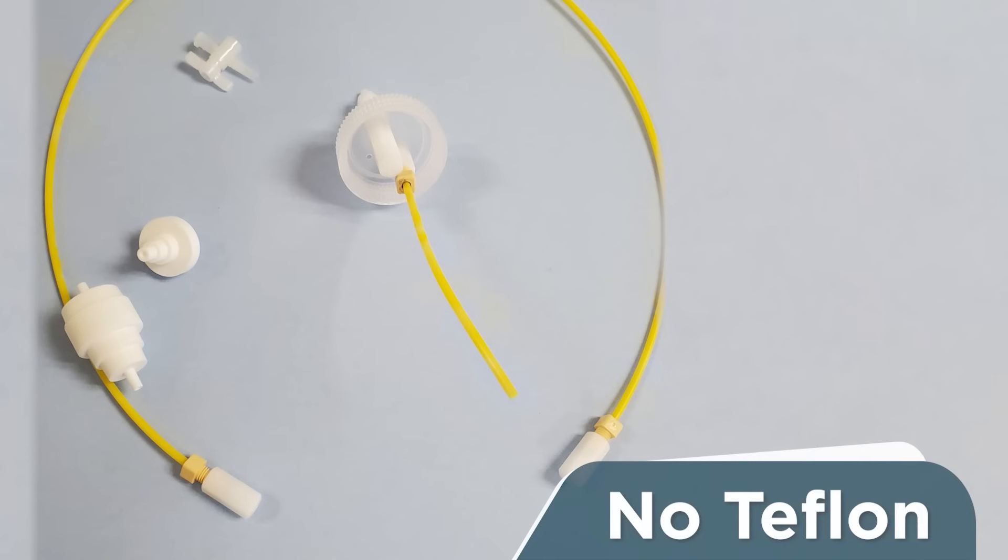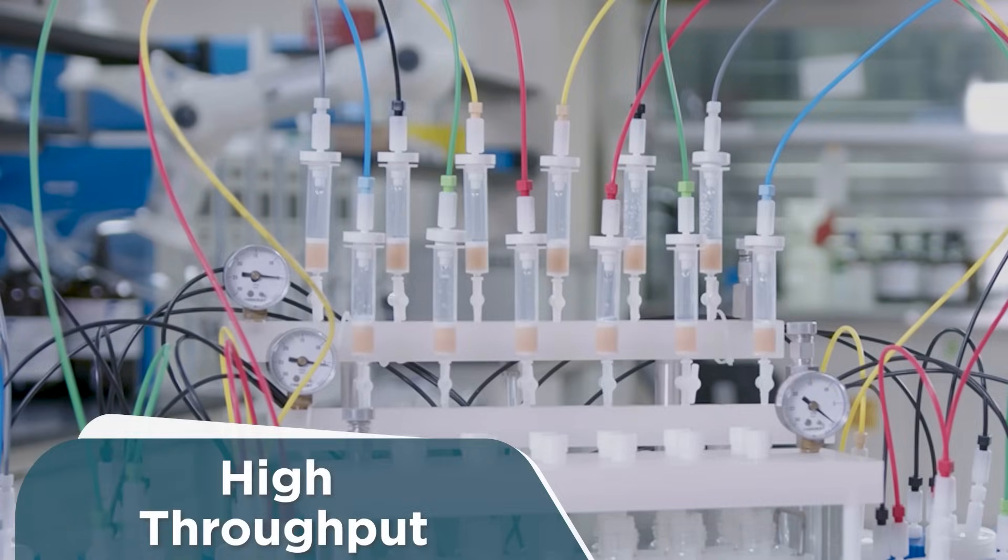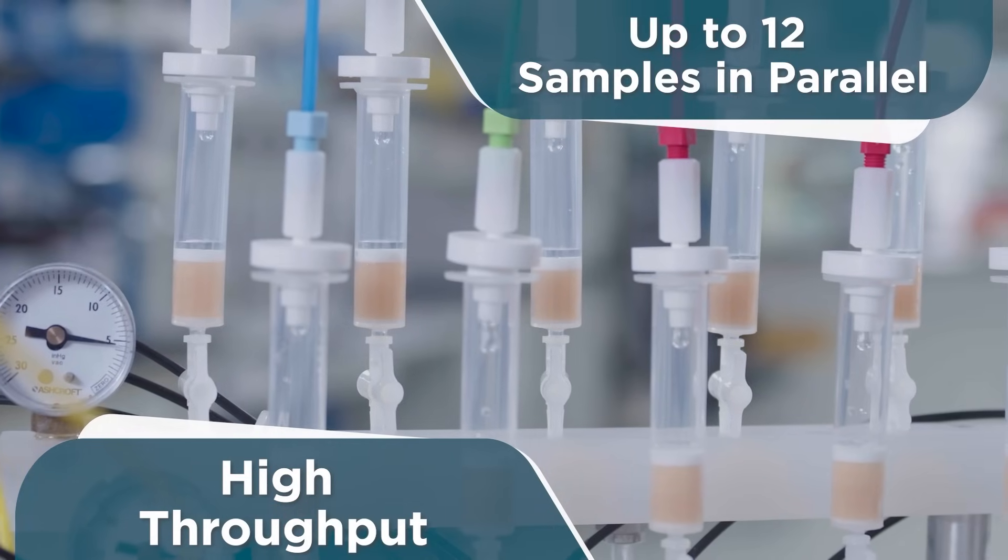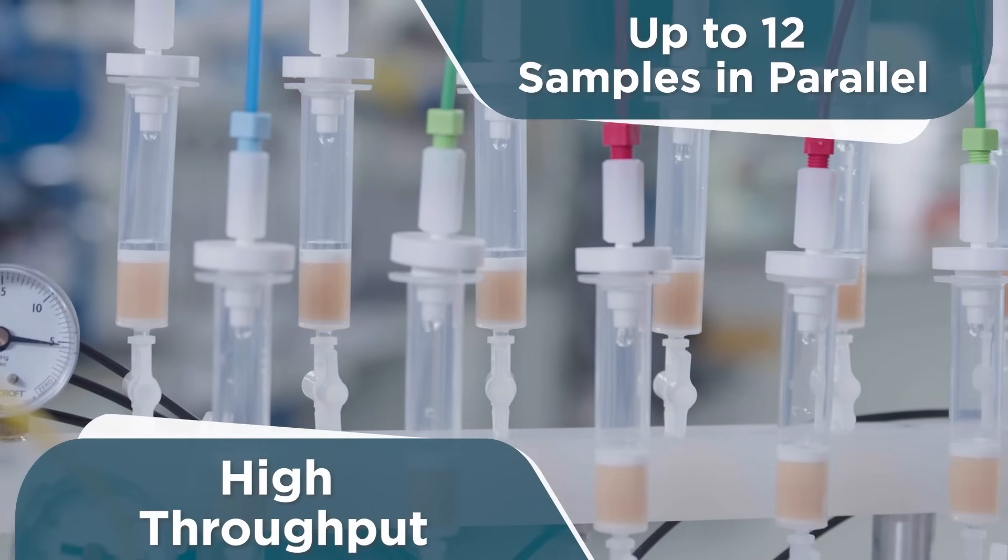The system contains no Teflon components. The EZPFC can extract up to 12 samples simultaneously, run 12 samples in as little as 40 minutes.